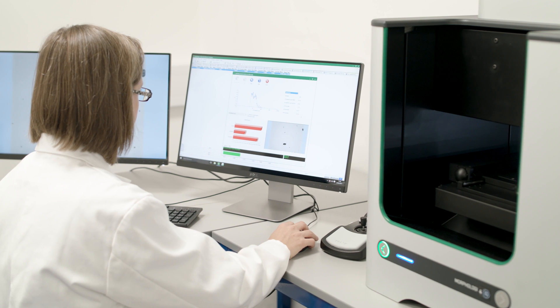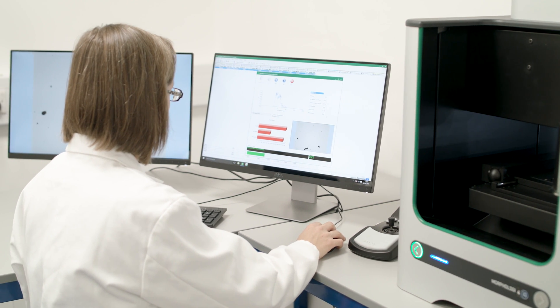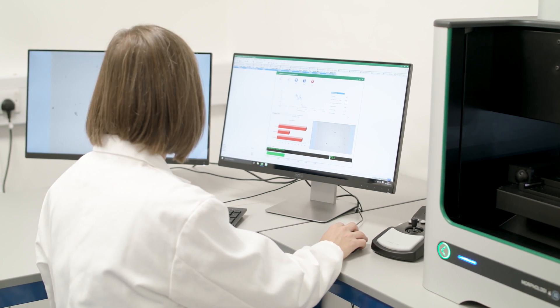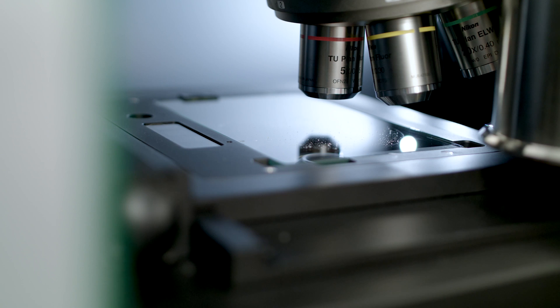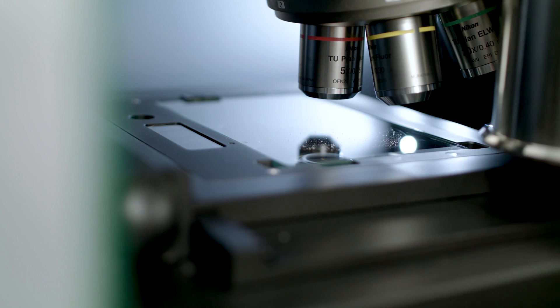From troubleshooting problematic actives in pharmaceutical formulations to identifying the root cause of out-of-spec parts in additive manufacturing.